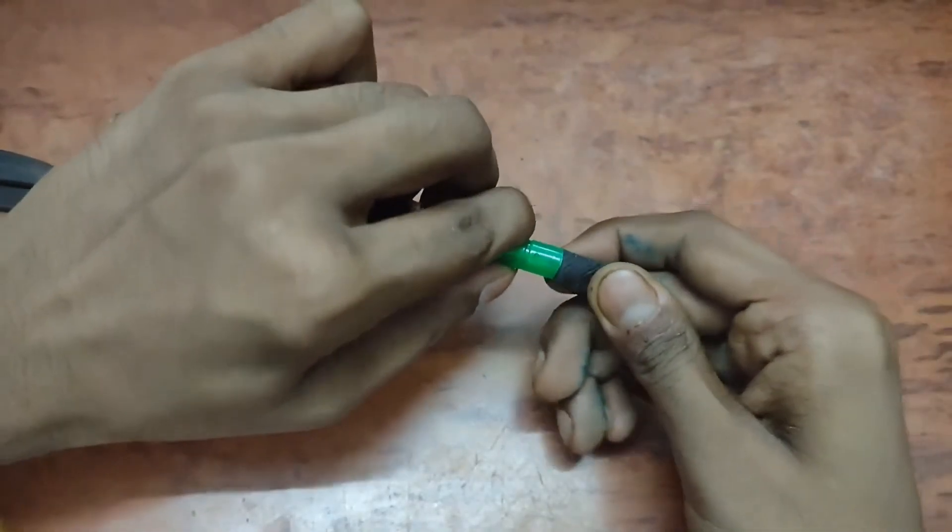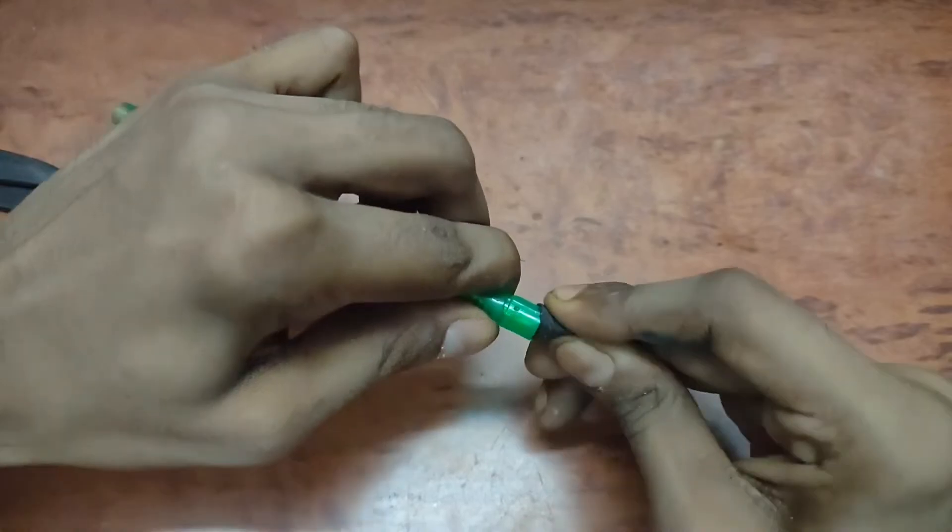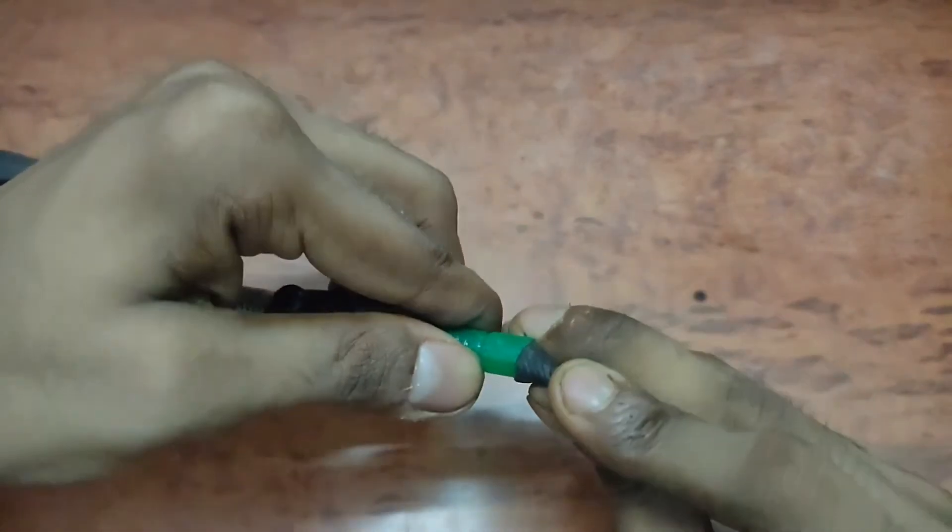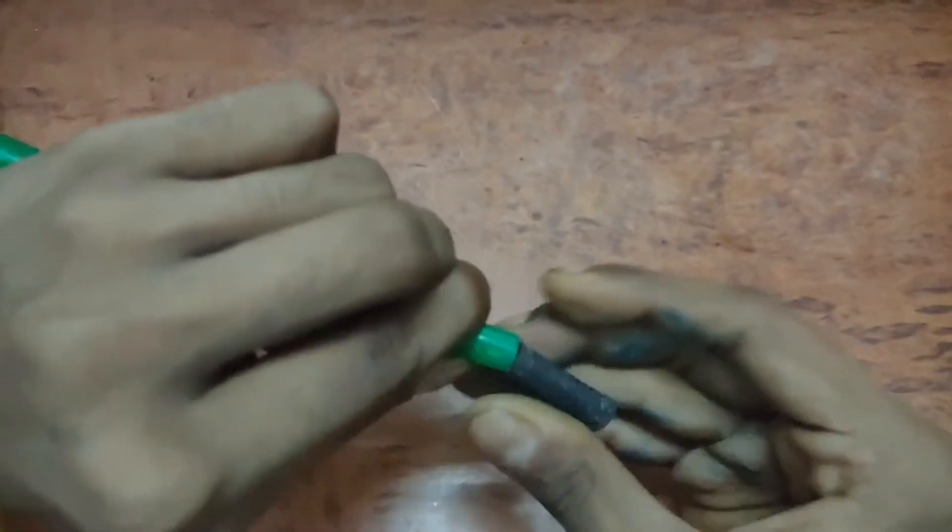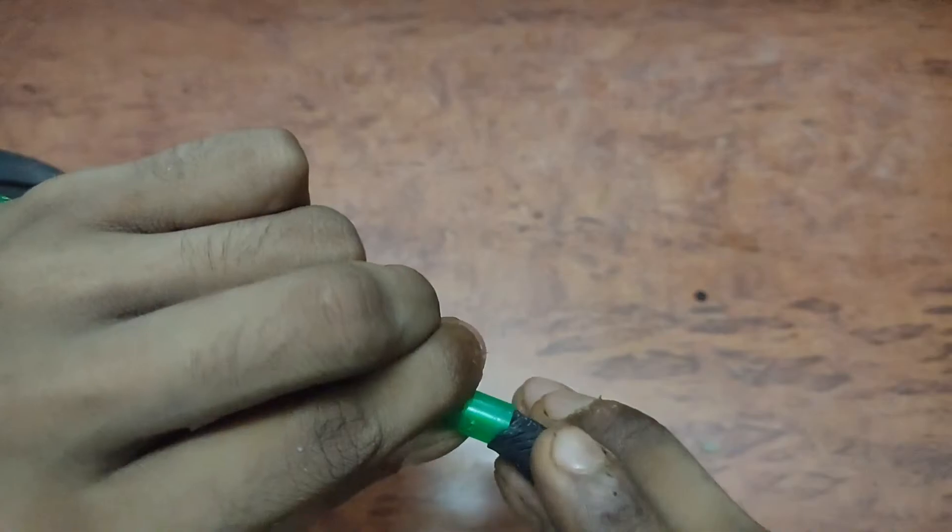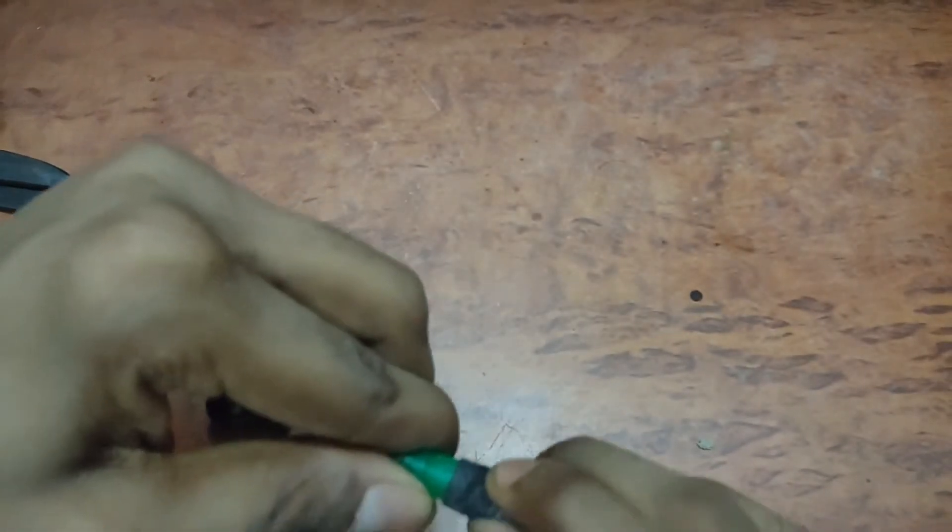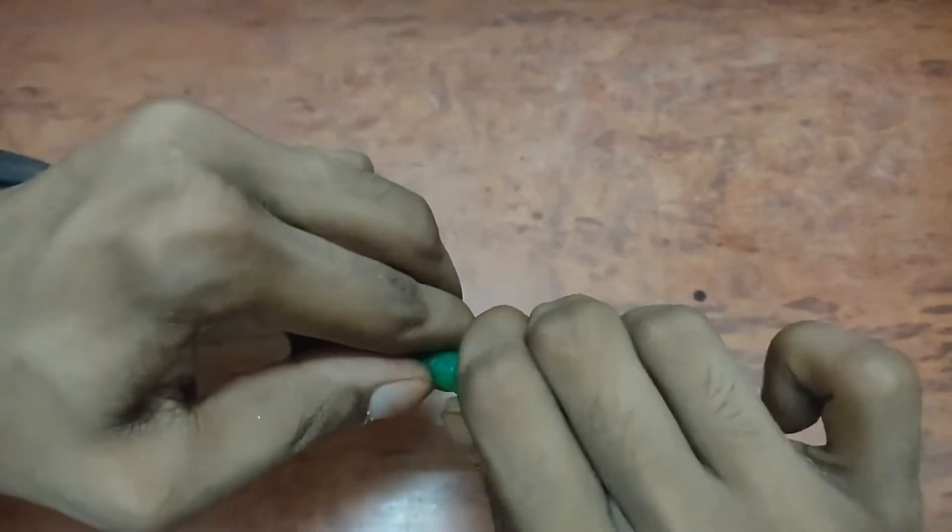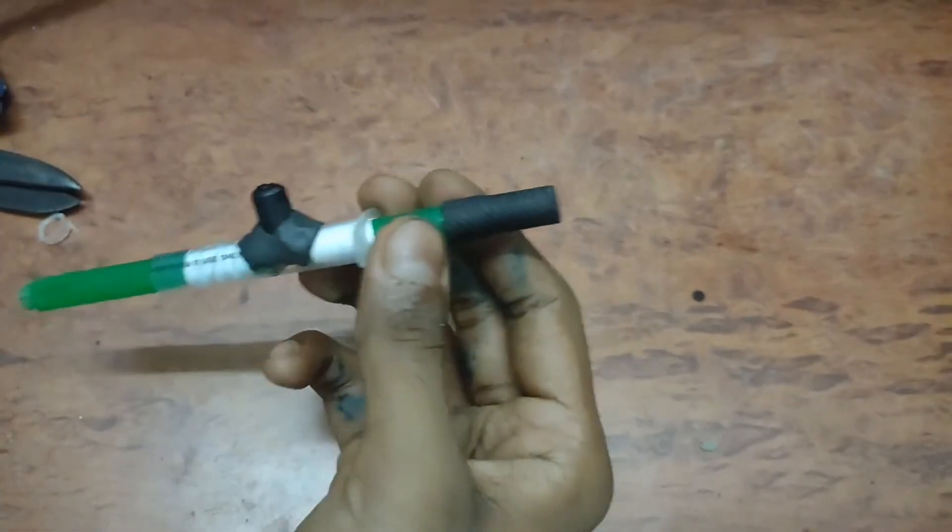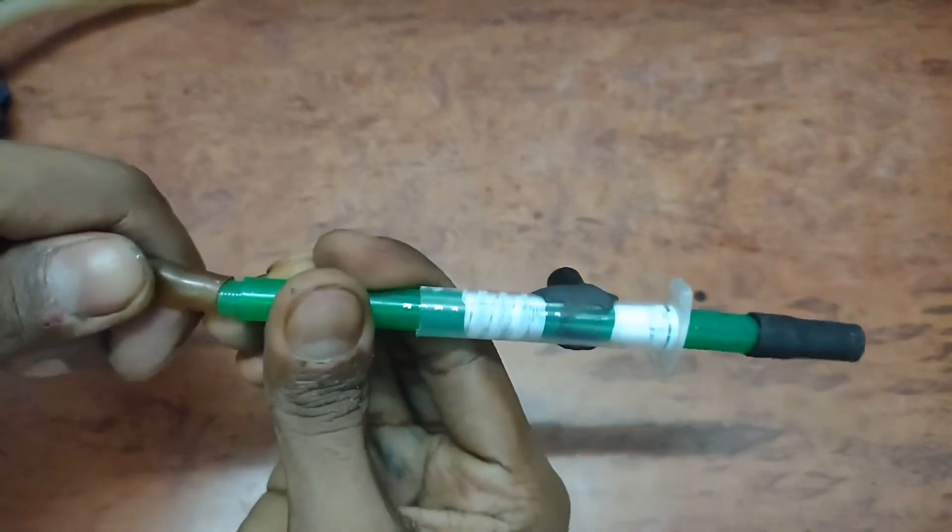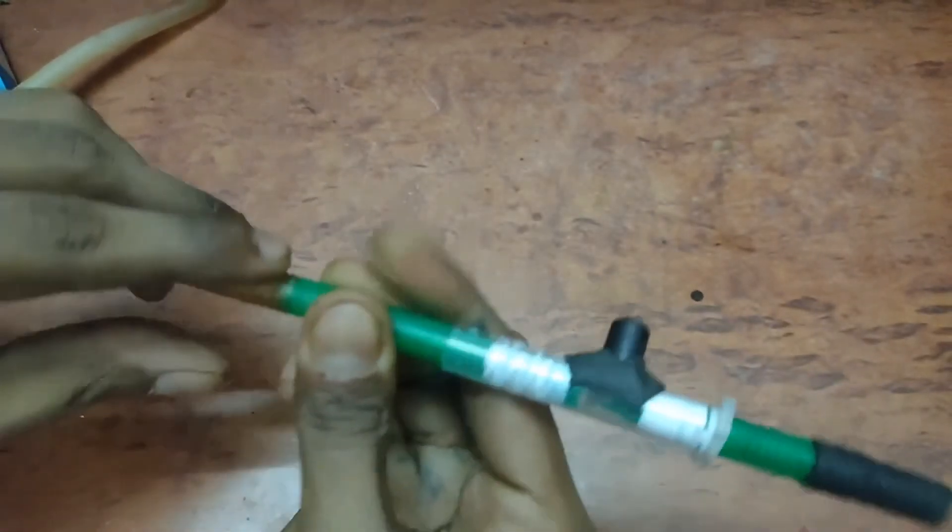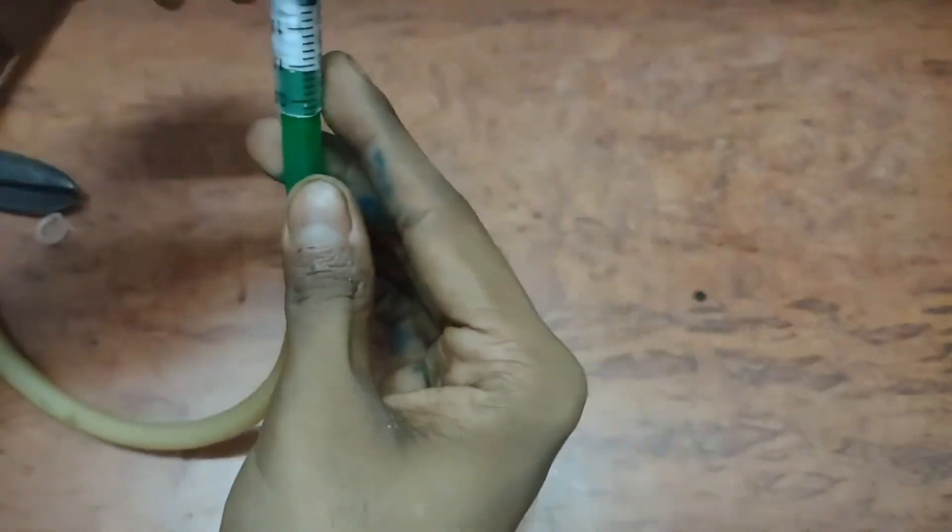On the top which is the water inlet, I will attach one rubber grip of a pen which will help me to connect my water aspirator to the nozzle of my laboratory. In the water outlet side I will attach one more pipe.